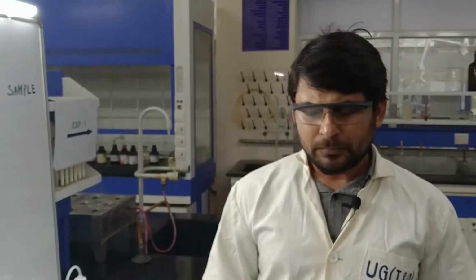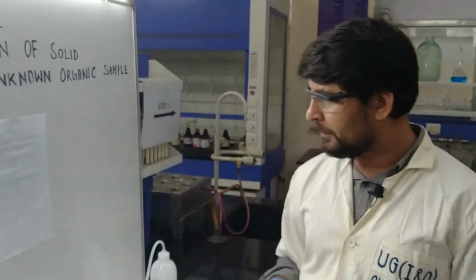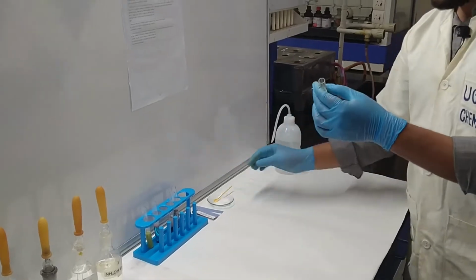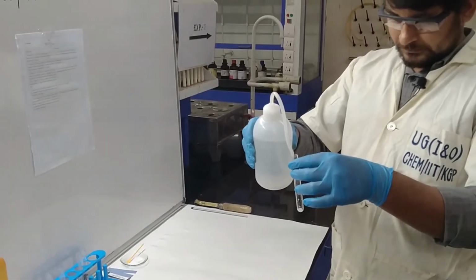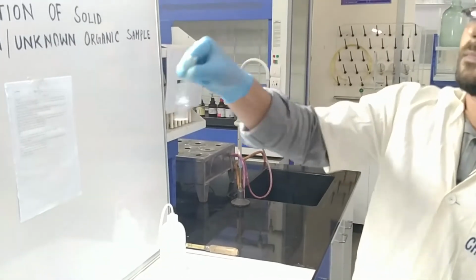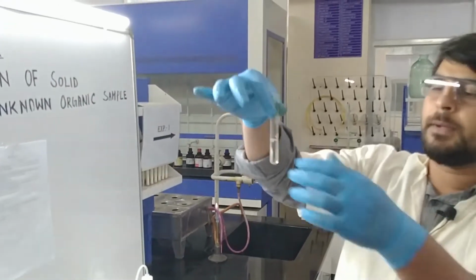Okay, so for the lead acetate test, what do we have to do? Again, we have to prepare an aqueous solution of our sample. So the aqueous solution is prepared.